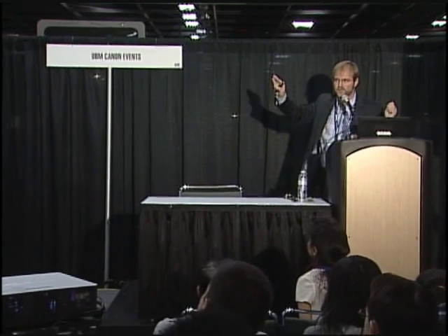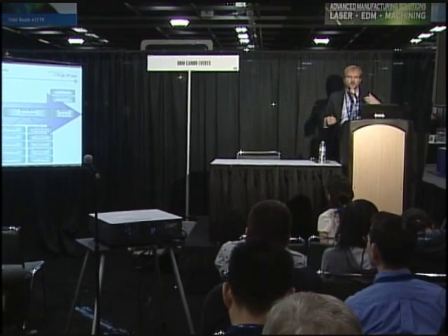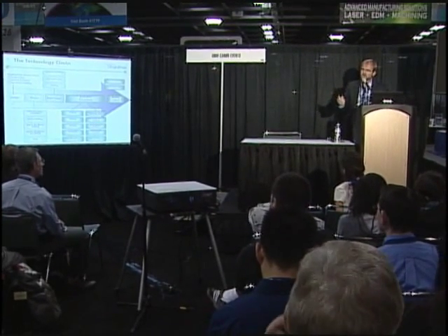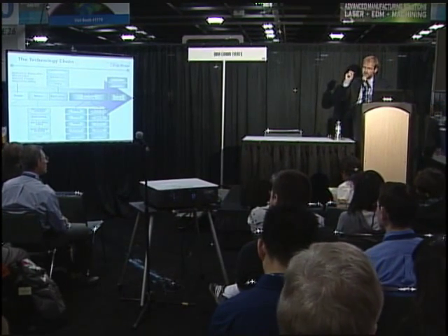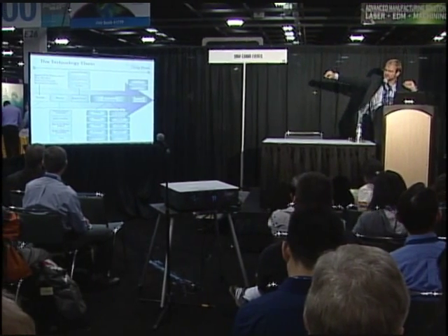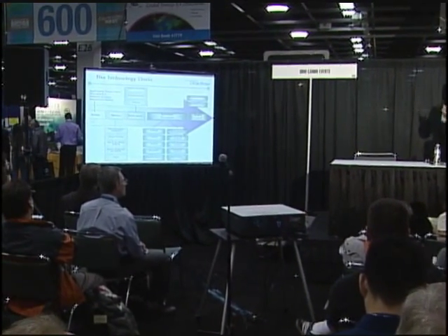Okay, that's what I meant with technology chain, in this case for the manufacturing of polymer-based microfluidic devices. It starts off with the design, and that sounds very trivial, but it's not, because already at that point you get input from all these different disciplines. Application know-how, for example: even if you only want to manufacture the devices, you have to know what this thing is supposed to be doing. For example, if your client is looking for low-abundant proteins, you have to make sure that your surfaces are smooth and coated in a way that you do not get unspecific protein binding, or that the channel from your input to your detection zone is as short as possible to minimize sample losses. So that's important. You have to understand the application.